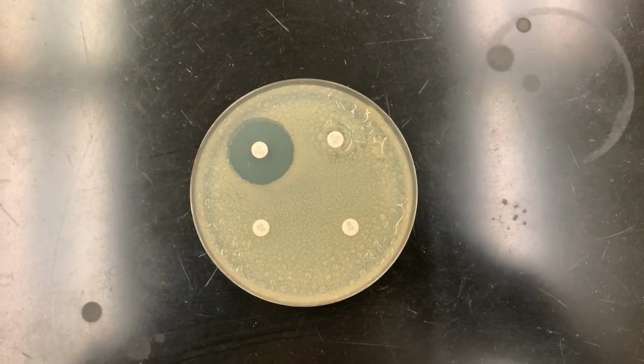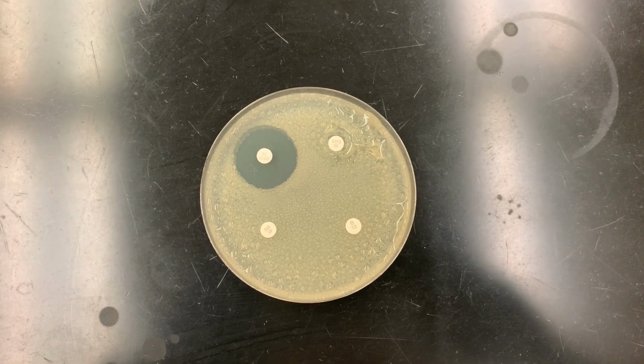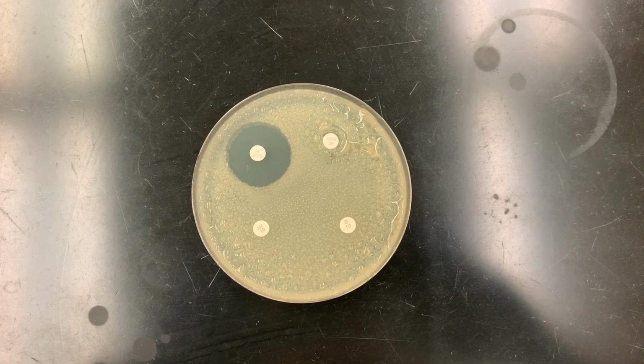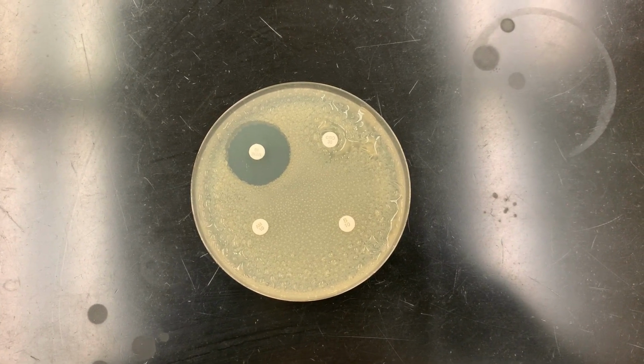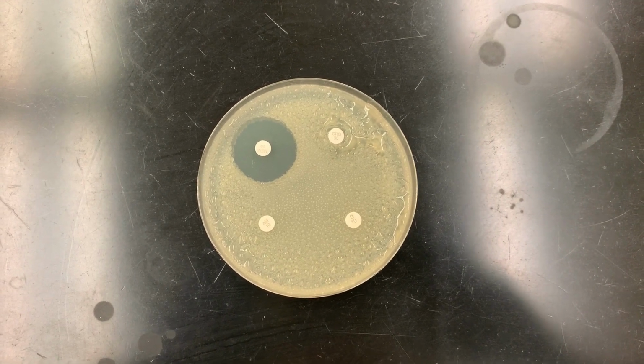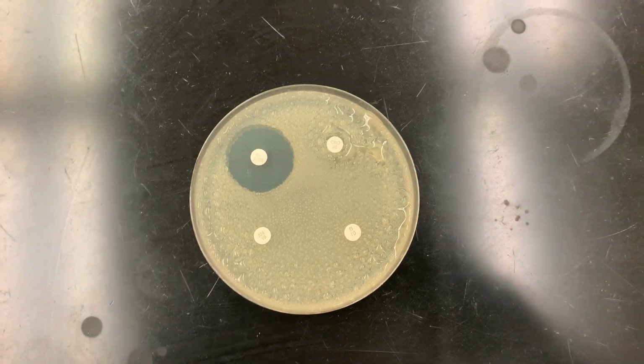So our disc diffusion or Kirby Bauer assay from yesterday is all done. The culture on the plate, the lawn, looks kind of weird. I think I did not let the plates dry long enough, so we have a little bit of condensation on the plate. But we can also see some zones of inhibition and some where there are no zones of inhibition.